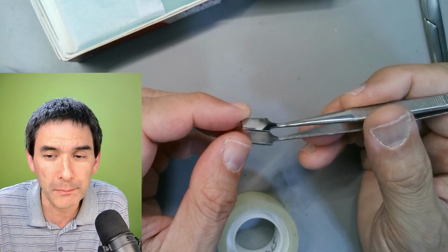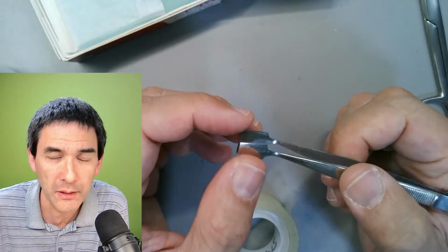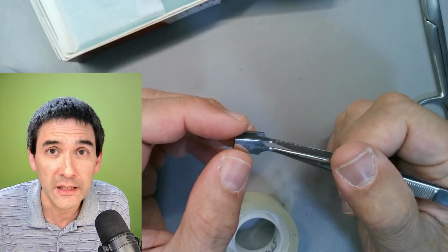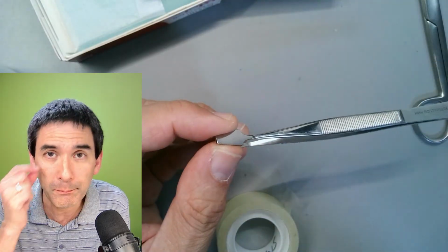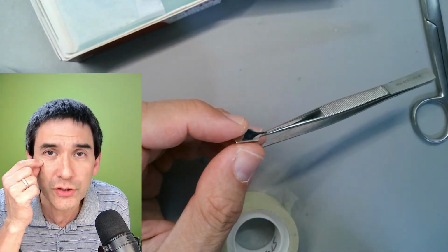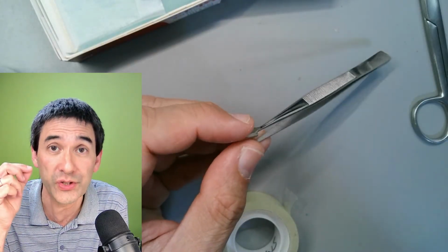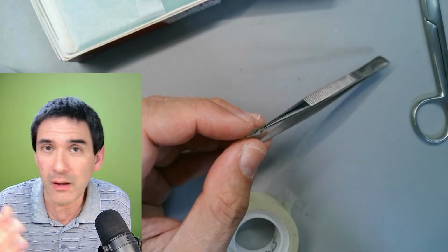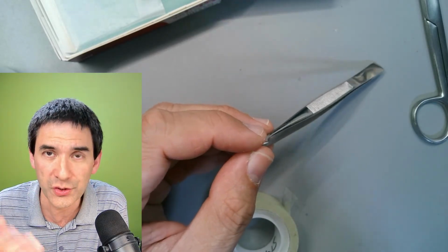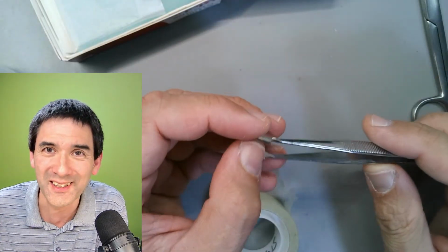Oh, they are found in pimple pus, Ever Smaller is asking. I will have to try this method. I did find the original paper. I think it was written in German. It was a couple of years ago, a scan. And this doctor actually put some pimple pus of a patient under the microscope, right? There was some kind of an infection that the person had. He made some drawings, and there were actually several of those in there, right? So I'm not saying that all pimple pus, all of them have it, but at least that's how this doctor kind of discovered it. And he made some drawings. Photography through the microscope didn't exist yet at that time.